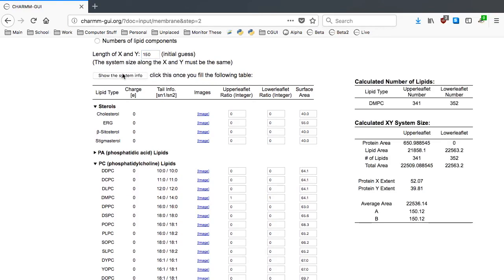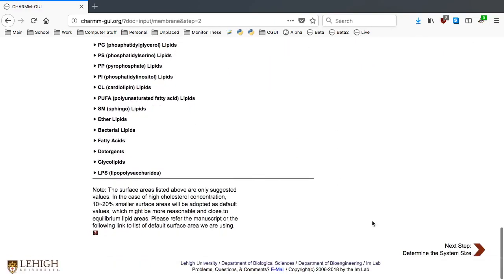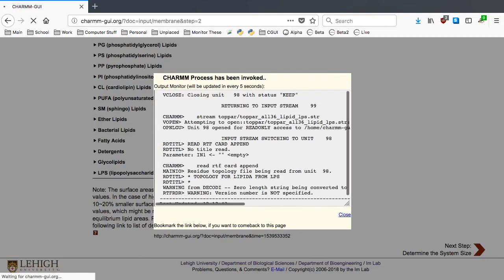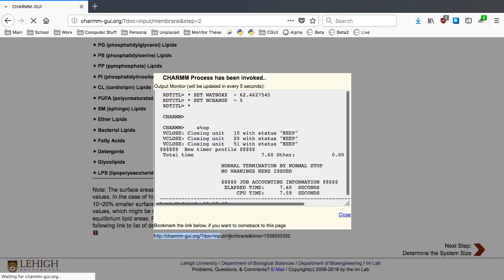Now we can go to the next step to see if our XY membrane dimension is reasonable. Membrane Builder is packing pseudolipid spheres in the upper and lower leaflets. This should take about 2-3 minutes.